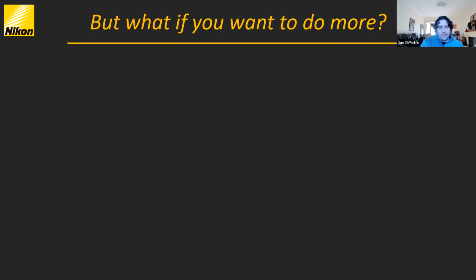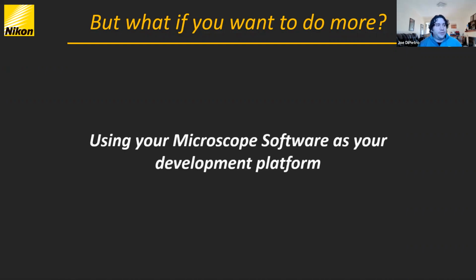And we talk about this in the context of using your microscope software as your development platform. So not only using the software to capture the images and use the tools that are available, but actually use the software itself to develop your experimental paradigm and your analysis.